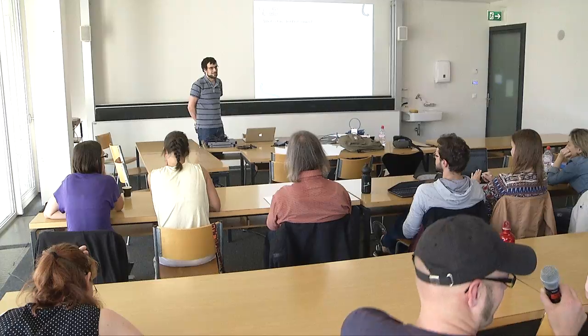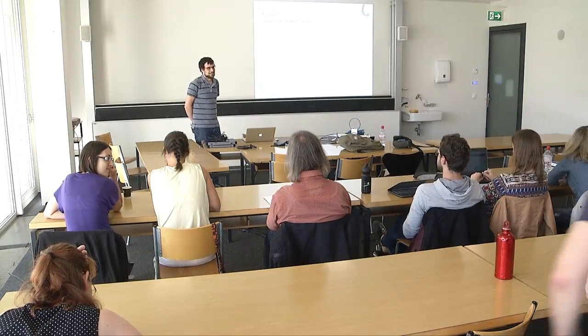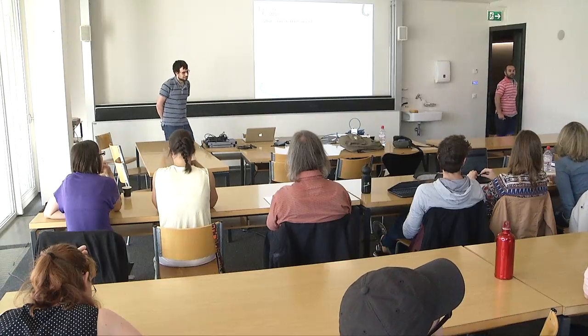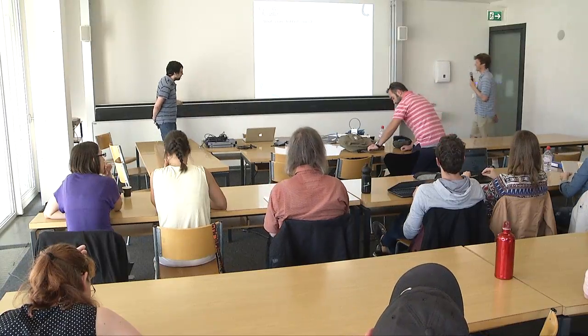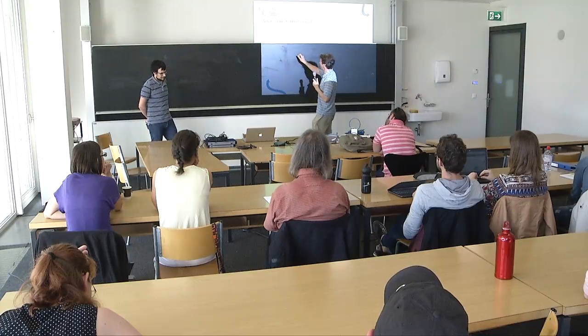More opinions? Brandon. So I'm going to introduce two new terms into the discussion. Actually, we've talked about them this week. One is peptide-centric analysis, and that's what we're talking about in the McCoss lab a lot these days.